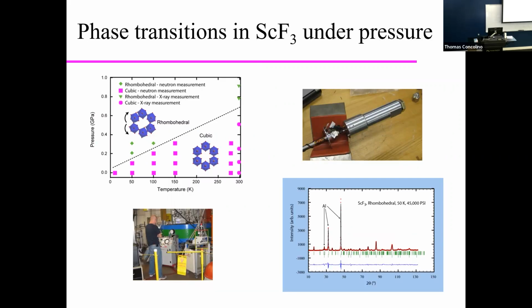Wow, you're going to be really annoyed with that. To an inch of aluminum metal. So neutrons are good for that. Not so easy with X-rays, absolutely impossible with lab-based X-rays.